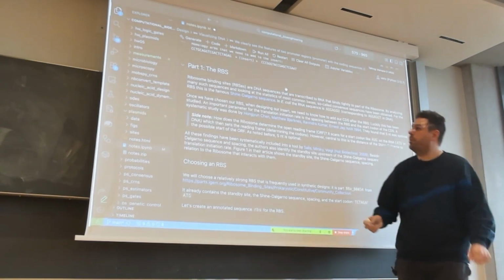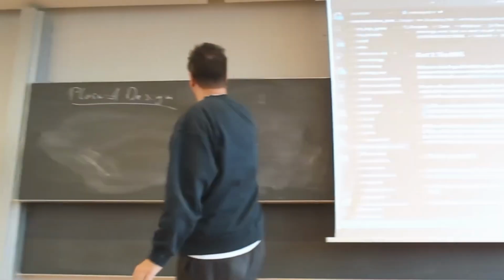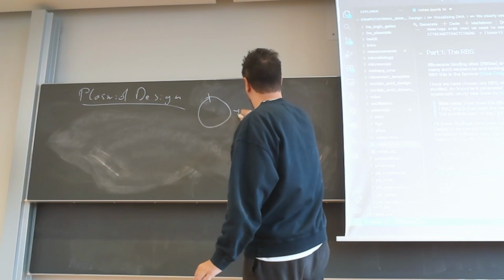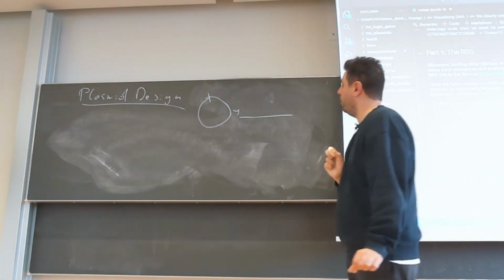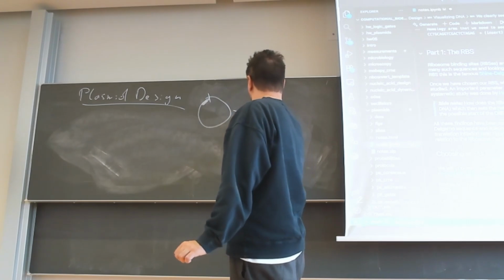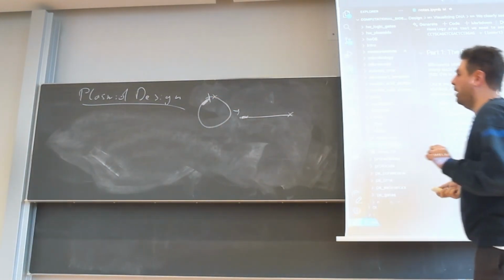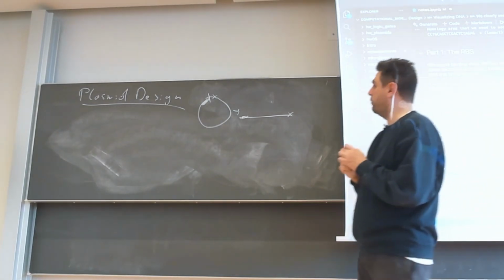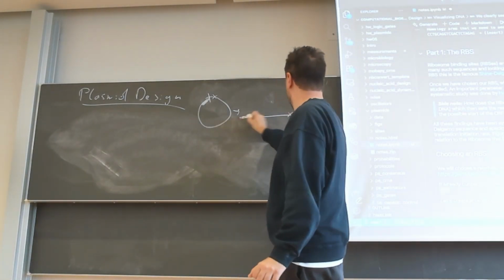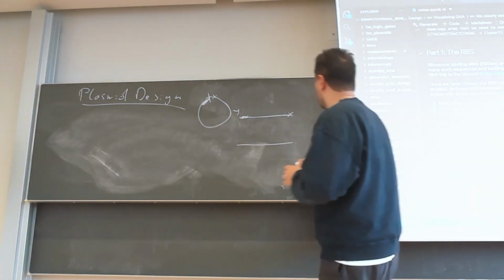All right. So now, what did we do? We have our backbone. We have cut it open, and it's now linearized, right, with this part being here and this part being here. Now we need our insert, the thing that we have to stick to these ends here. And how does our insert look?